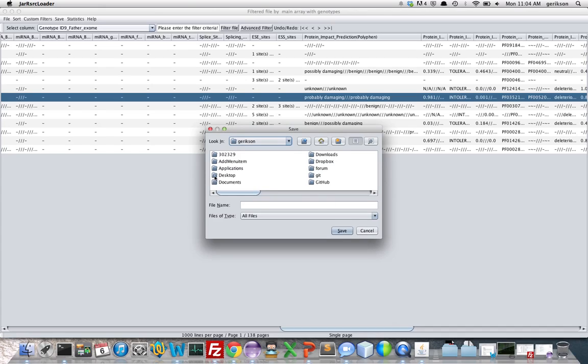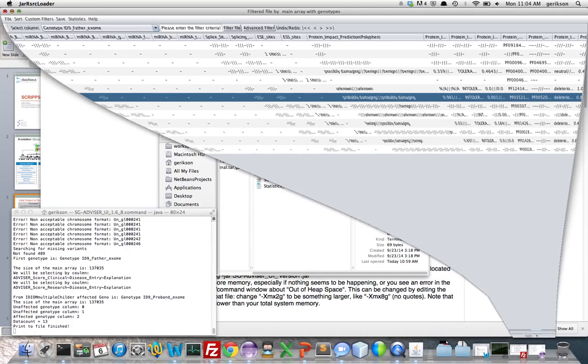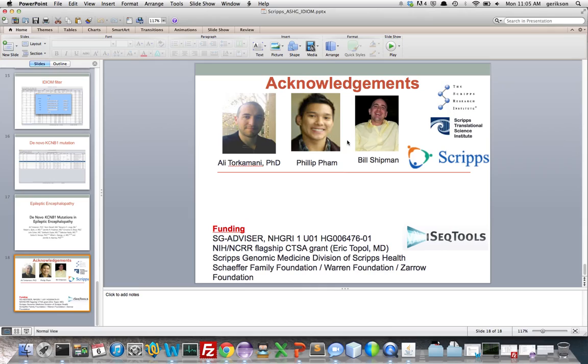You can save these results to a file. As I said, my PI, Dr. Torkamani, found 12 individuals with variants in the gene KCNB1, and they were diagnosed with epileptic encephalopathy. And thank you to Dr. Torkamani, Phillip Pham, and Bill Shipman.